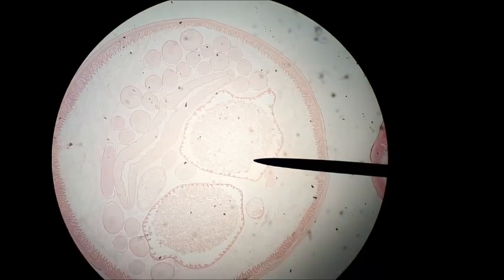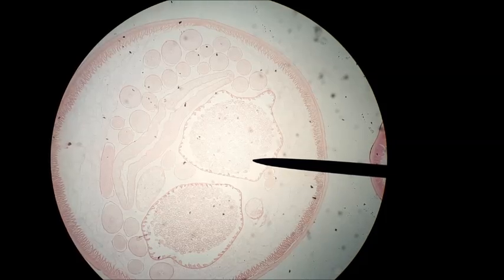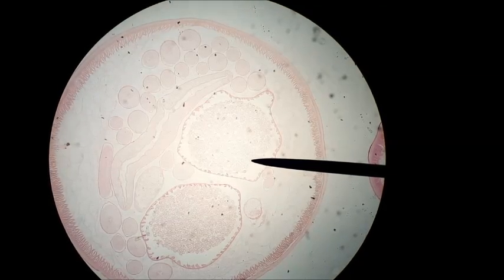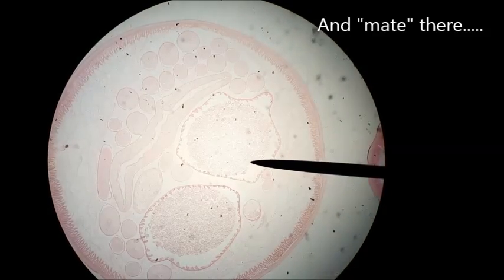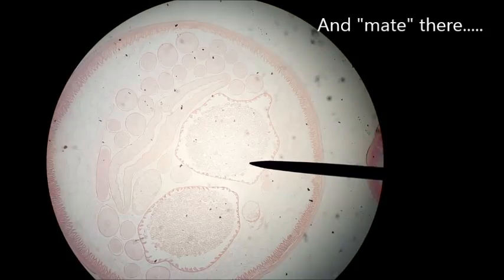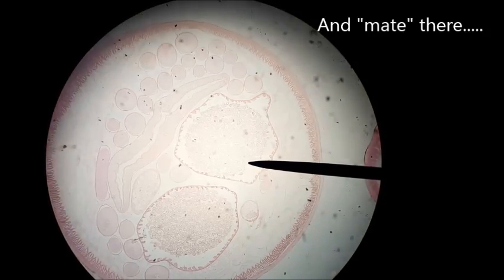So the female is much larger. You can see the male body diameter over to the right. The male, apparently when he reproduces with the female, will nestle in a groove in the side of her body and reproduce there.